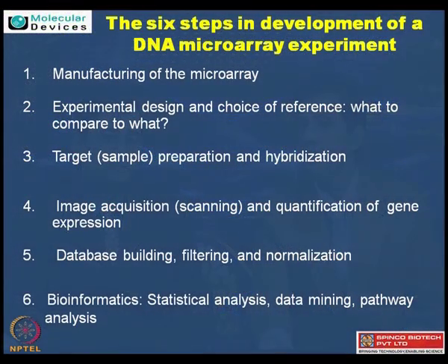I think it will be useful if you can first give some steps for the DNA microarray experiments. Although this is a proteomics course and I have been talking more about protein microarrays, this whole technology got initiated from DNA microarrays. So just so that students have some idea about how DNA microarrays are performed, give some brief steps about the overall DNA microarray technology, and also how and what GenePix can help with in the microarray process.